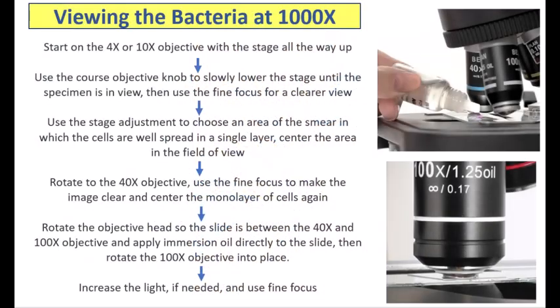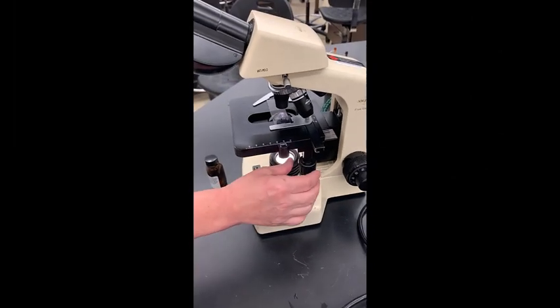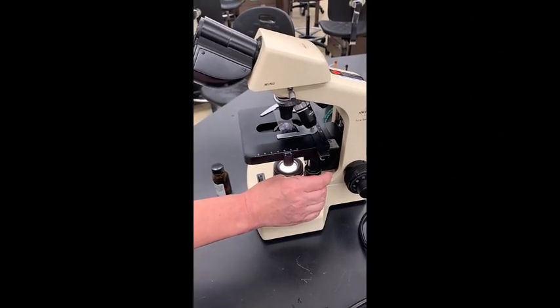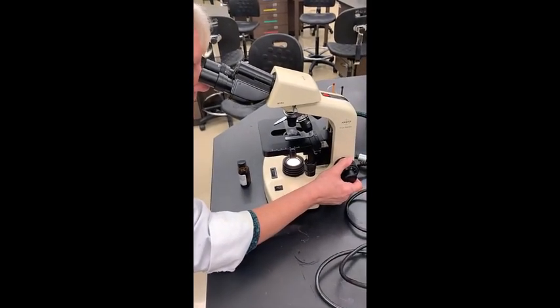Now place the stained smear on the microscope stage bacteria side up and view on the oil immersion. As a refresher, when using the microscope, always start on the 4x or 10x objective. Start with the stage all the way up and use the coarse objective knob to slowly lower the stage until the specimen is in view.